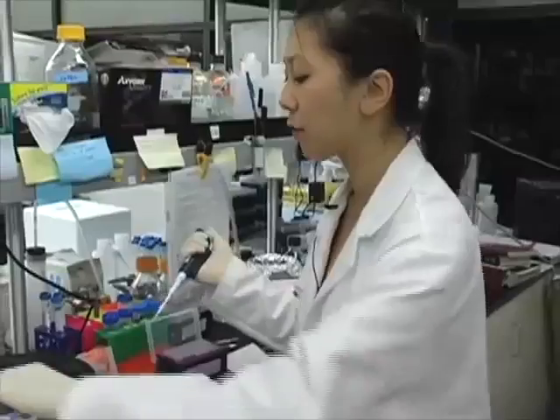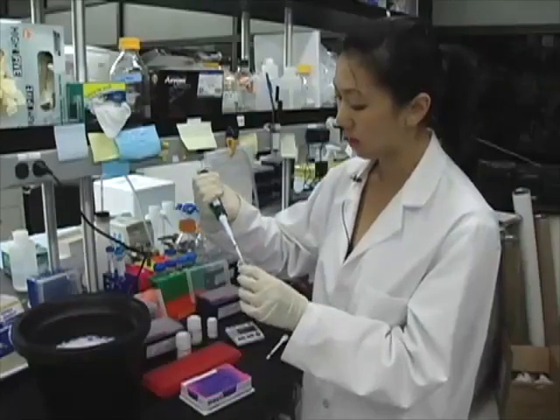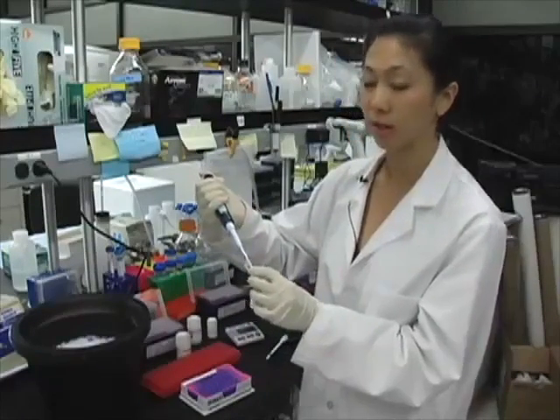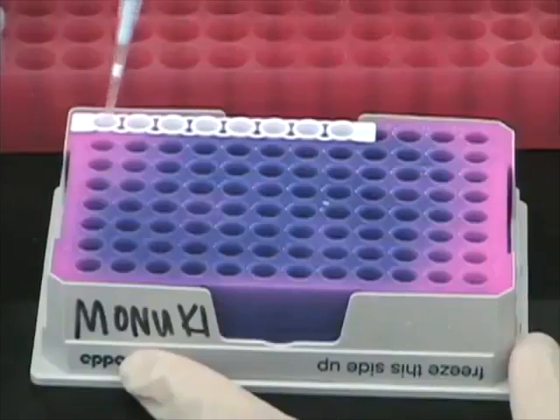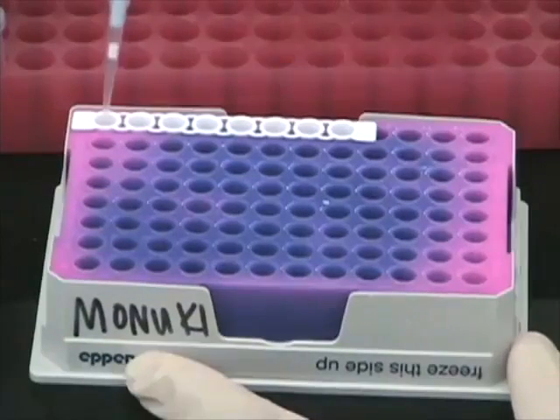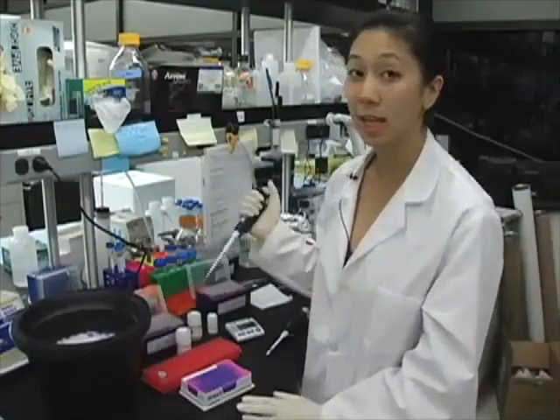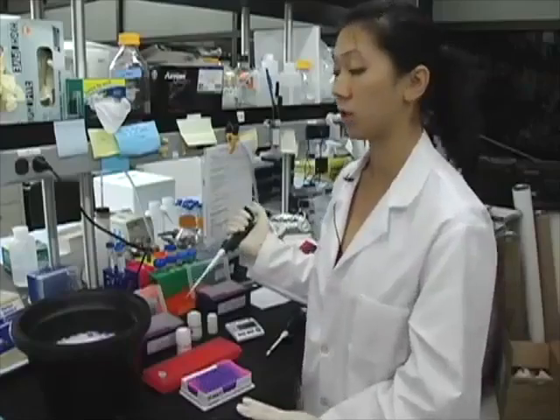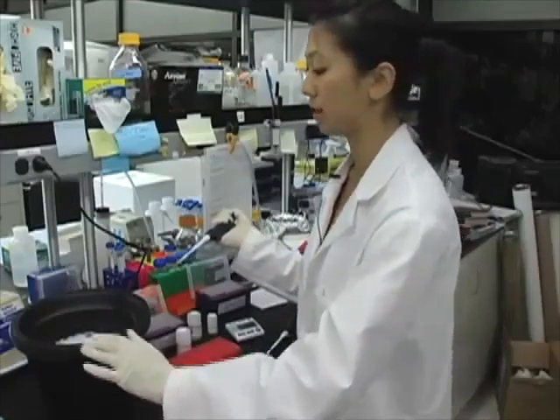Then I will add 4 microliters of the neutralized extract to the 16 microliters of the master mix in the well for a total of a 20 microliter reaction volume. And I'll do the same thing for the positive and negative control, adding 4 microliters to 16 microliters of the PCR master mix.